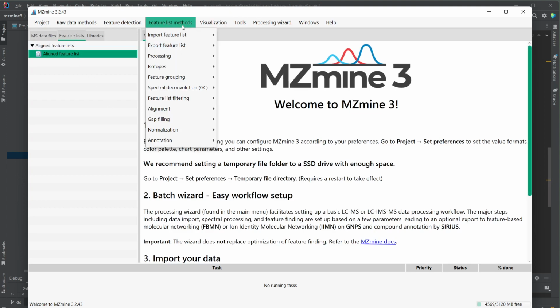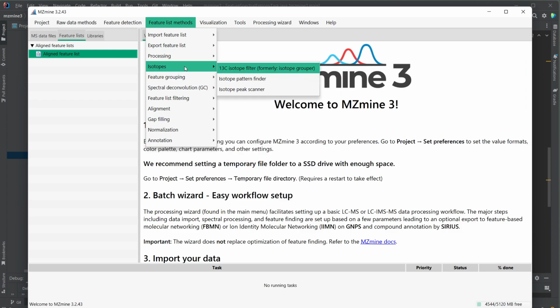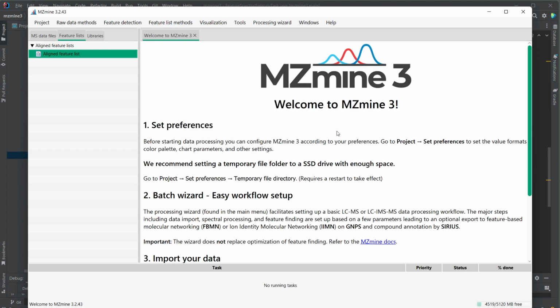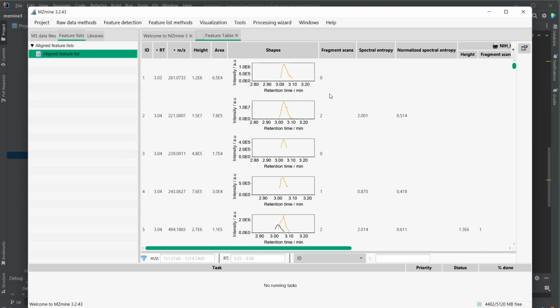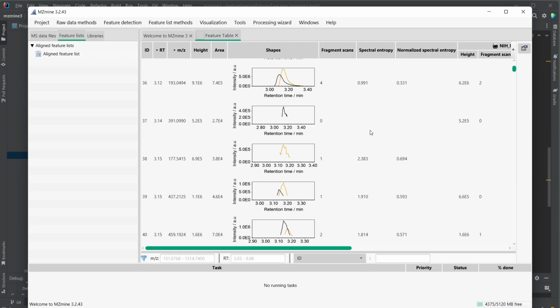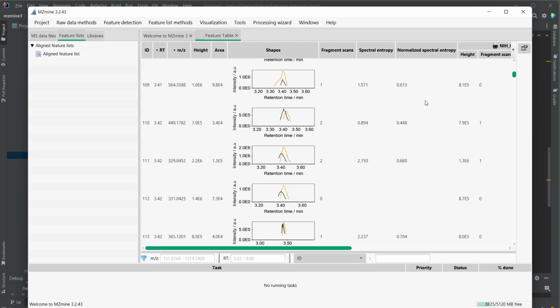Now, just to check, it should still work, pretty fast. So we select the feature list, we run, and it's done. This time we actually ran on all the different fragment scans. It's a very small data set, but it's also a bunch of rows, and we have two samples. We have a bunch of different fragment scans here.